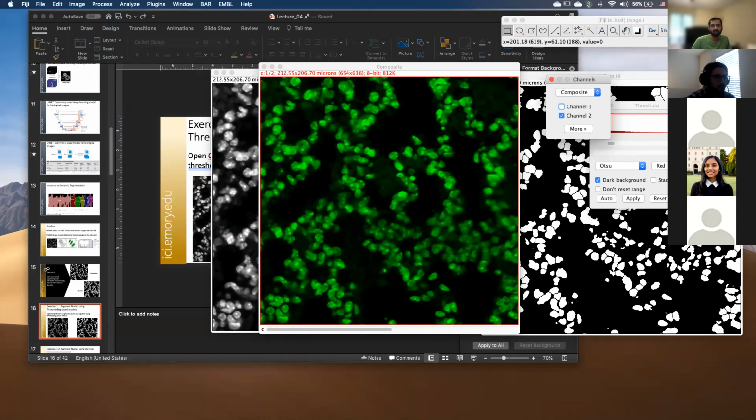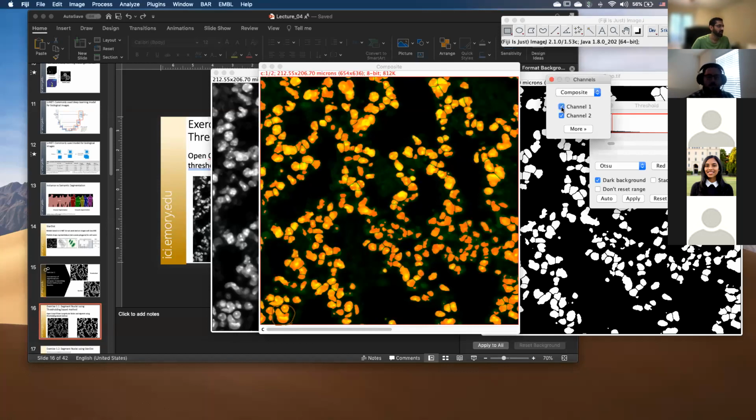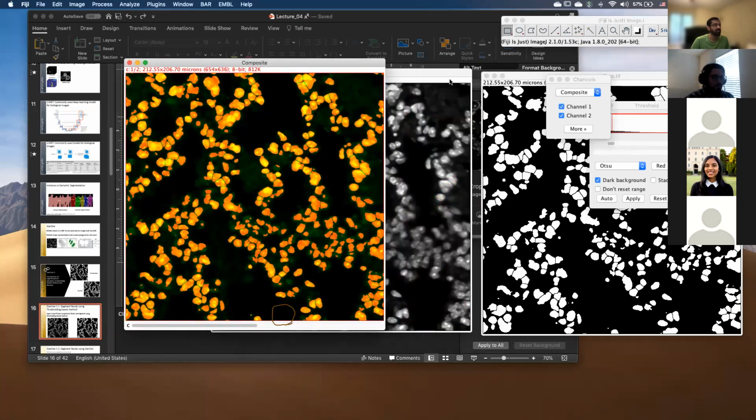And if I try to annotate this, for example, right over here, these are 1 and 2 nuclei. However, if I look at my images, this one appears as 1, right? So there are lots and lots of examples where it just appears as one object versus multiple objects.